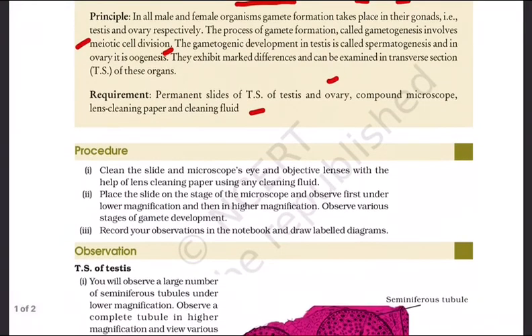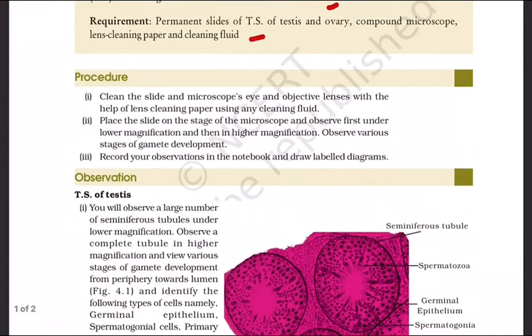So you need to take a transverse section. Of course, we have ready-made permanent slides in our lab. You can do that. What is the procedure? Clean the slide and the microscope's eyepiece and objective lenses with the help of lens cleaning paper.